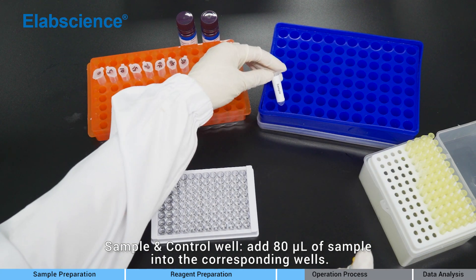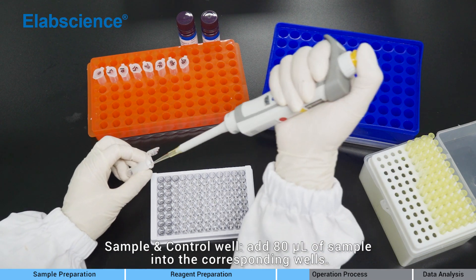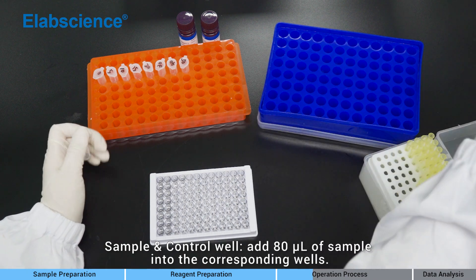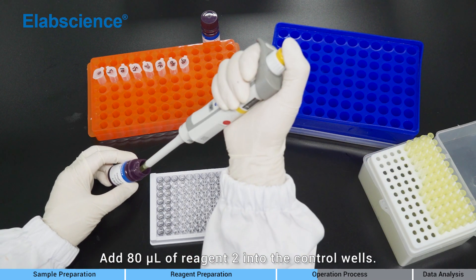Sample and control well: Add 80 microliters of sample into the corresponding wells. Add 80 microliters of reagent 2 into the control wells.